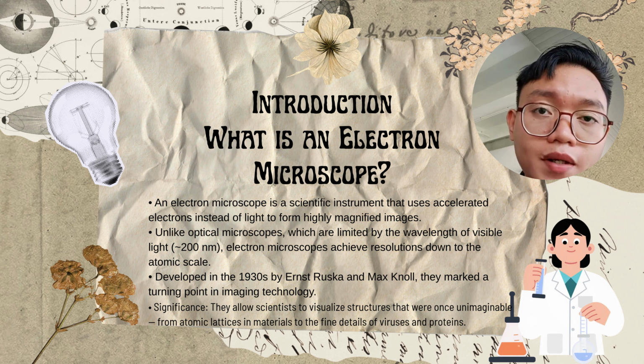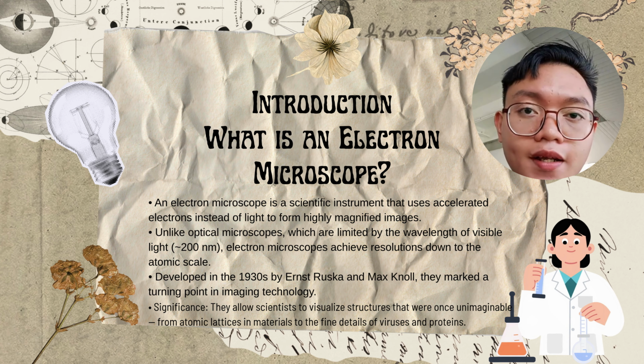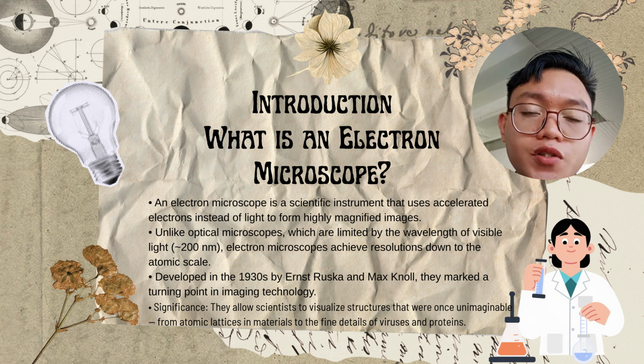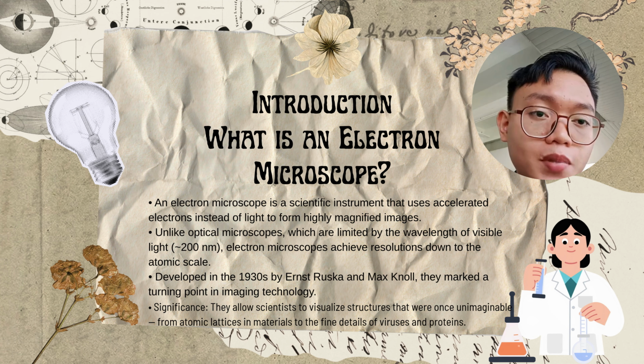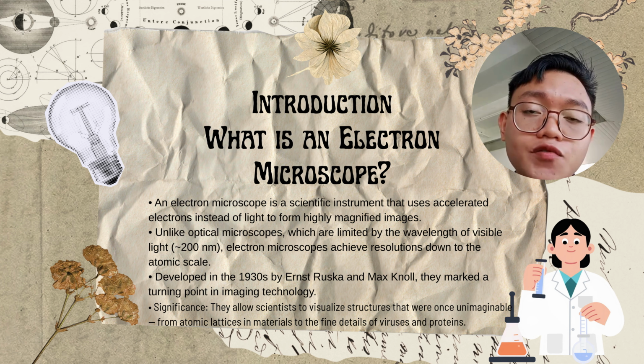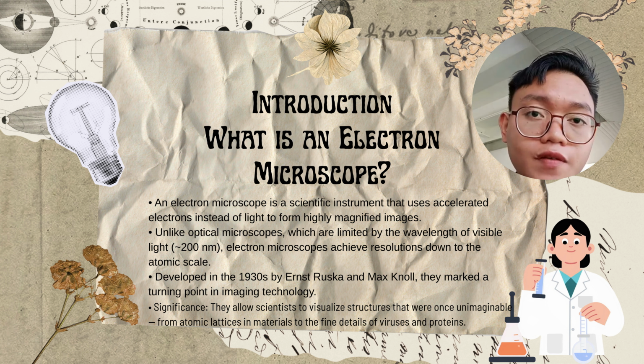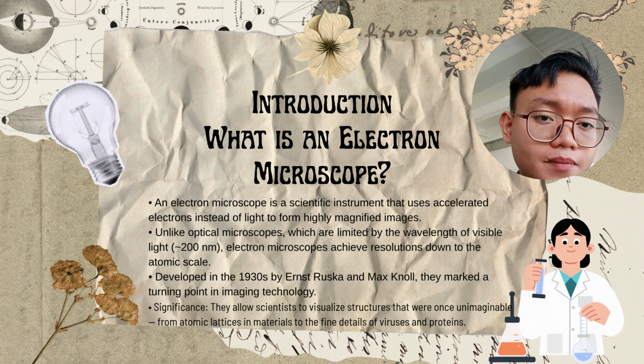So hello everyone, we begin by learning what an electron microscope is. An electron microscope is a scientific instrument that uses an accelerated electron beam instead of light to form a highly magnified image. Unlike traditional microscopes, which use light and are limited by the wavelength of light, an electron microscope is able to achieve an astonishing level of detail when scanning through a specimen at an atomic scale.